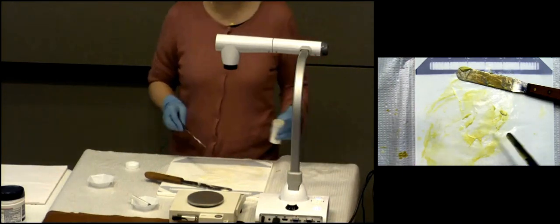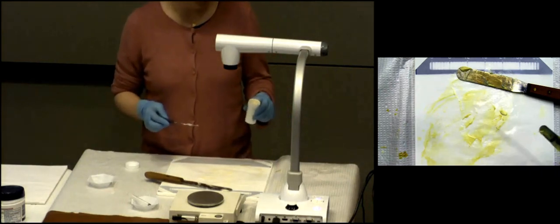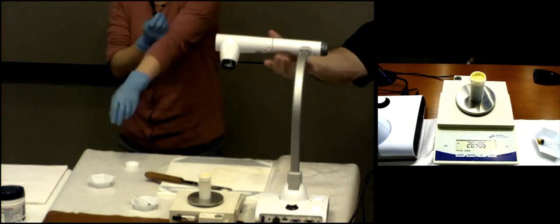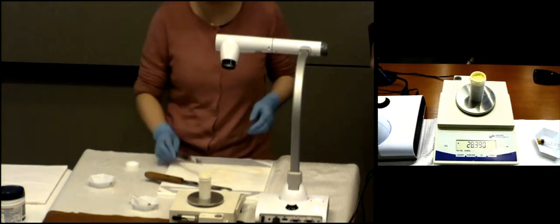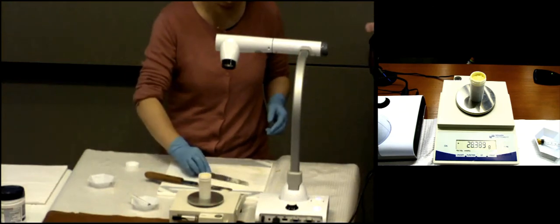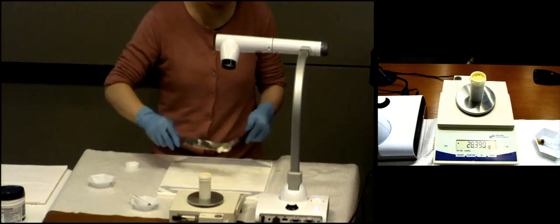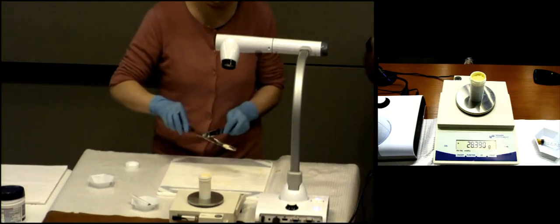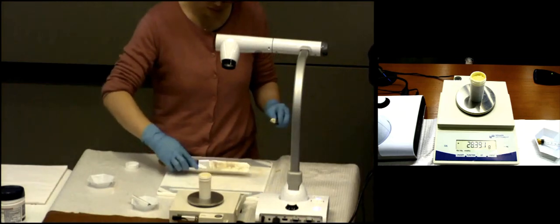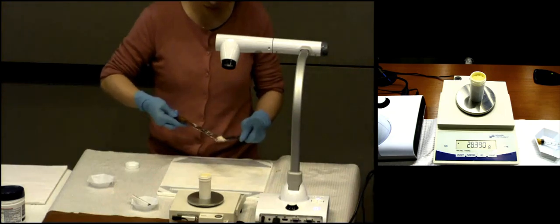How much do I have left over here on my piece of parchment paper? Not that much, all right? So maybe I want to see, am I really there? Let's see my weight. So on your QA, write the range. You don't have to, but let's write down the acceptable range. Certainly on the test, you need to be within what range do we allow you? 5%. So what is 5% of 30 grams? 10% would be 3 grams. Half of 3 grams is 1.5. So you could be as low as 28.5, as high as 31.5.